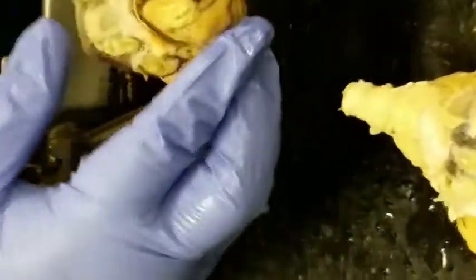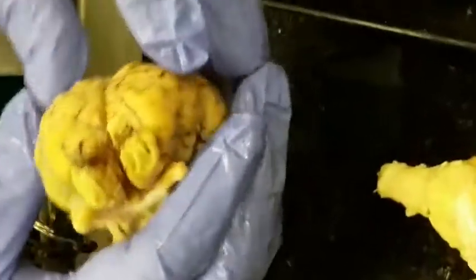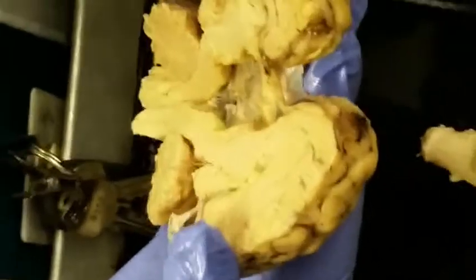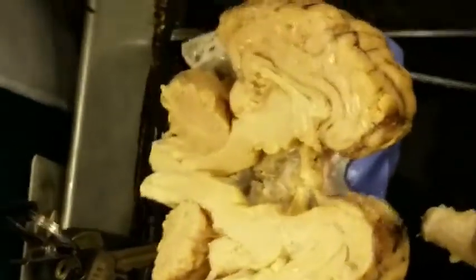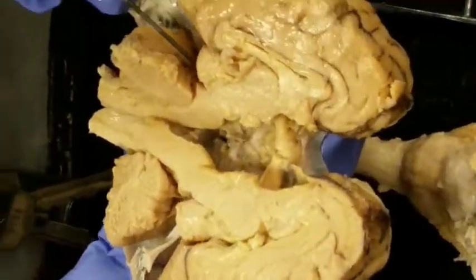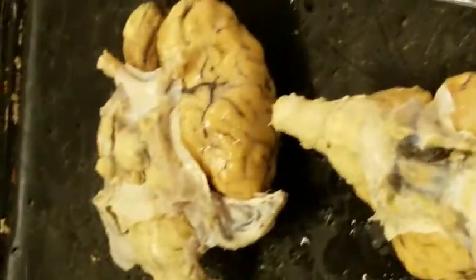In all of them, the pituitary gland was removed, so you're not going to see the pituitary. But that's called the mammillary body. Can you show the pineal body on that one? Let's see, some are broken and fall off. Remember, these were dissected previously by other students. In this one, the pineal body broke off, but you can see the corpora quadrigemina, two mounds on that side.